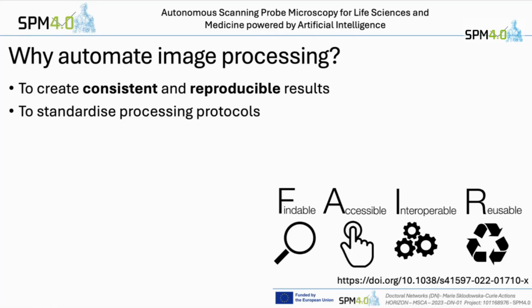And linked into that is being able to standardize these processing protocols. The order in which you carry out all of those processing steps, the parameters that you use through those processing steps, all of them need to be standardized within the community really, to create that really consistent way of doing things. It also saves a lot of time. It maybe took you 10 minutes, 5 minutes to process the image there. If you've got hundreds of images to go through, that starts to add up to quite a lot of time. And can you definitely get it exactly the same between each of those? Possibly not.